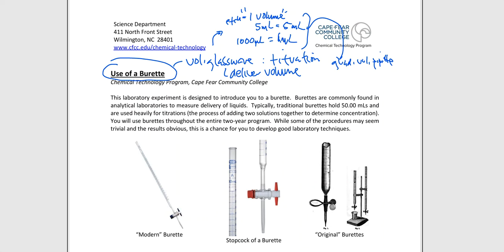But yet again, I have to make a determination on what to pull up and what to deliver. And that is not the scenario with the Burette. This is me going in to do a lab test, and I don't quite know what volume it's going to take in order for me to do that experiment or that activity or that SOP the best way possible. So a Burette comes in to fill in the void.